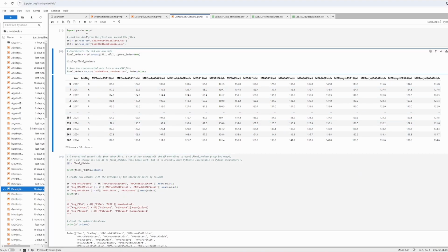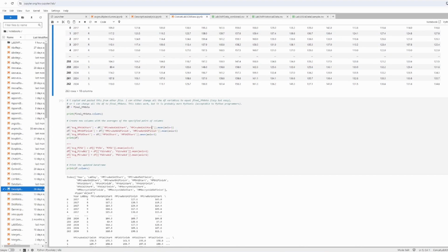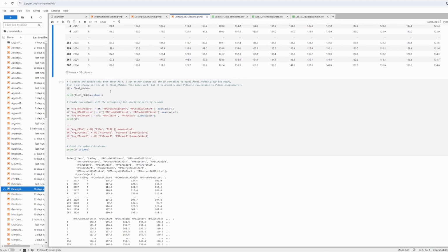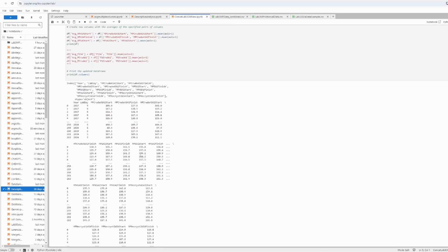This is the preferred route here because what you can do is keep this all in one Jupyter Notebook file, and when you save it, all this information will be combined together. This is definitely the preferred way to do it. It's just here I was showing the example that we've already had from a box plot example, but now we're taking that box plot example and pulling it into another cell. We're starting to combine different statistical analysis and manipulations from cell to cell to cell as we go through.